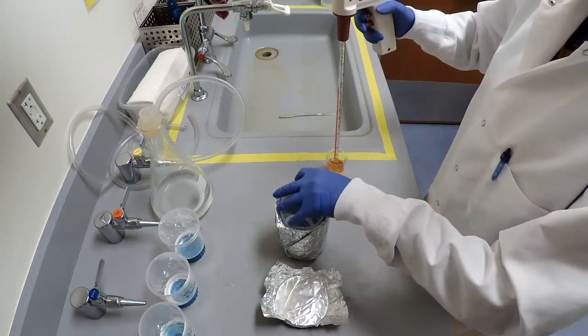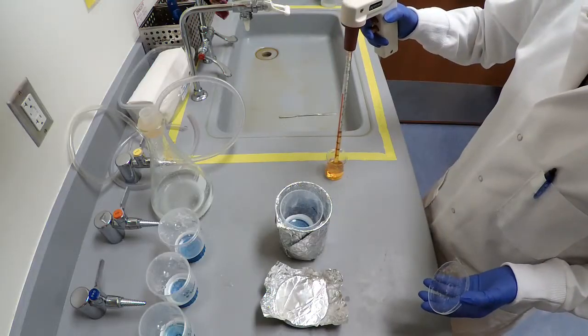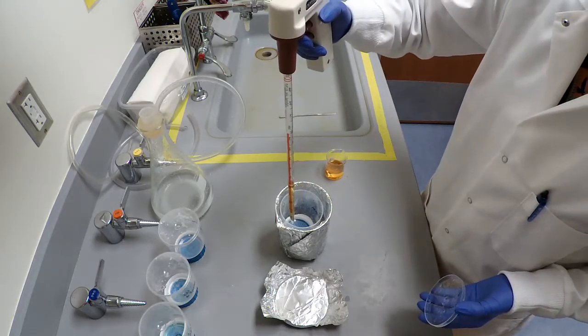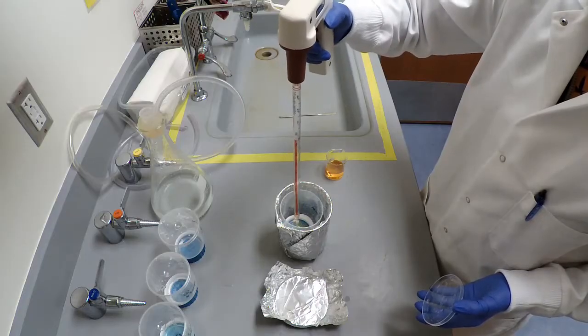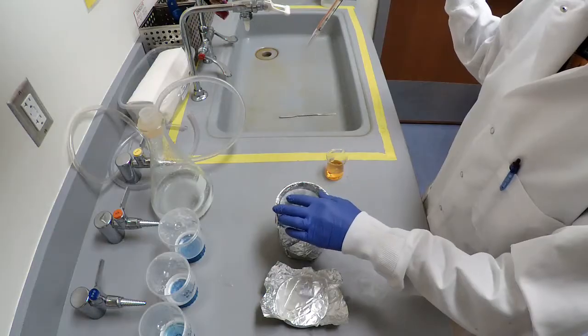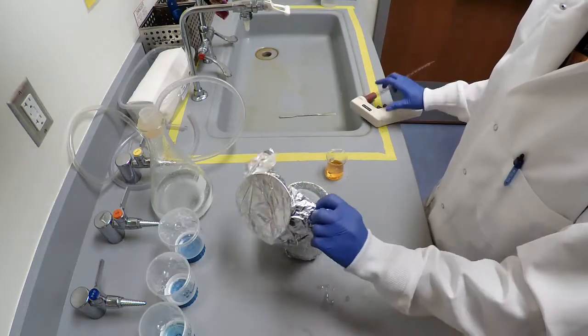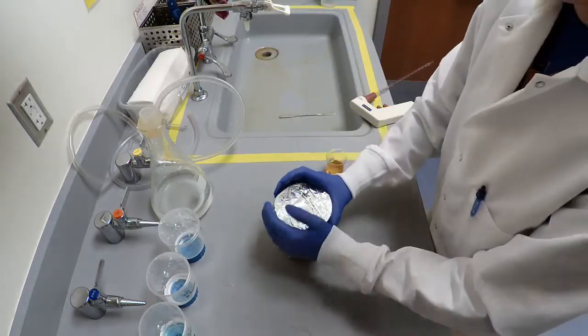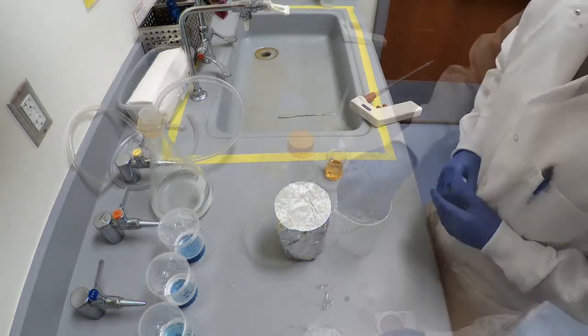Add 5 ml of Nile red at a concentration of 10 micrograms per ml. Cover with a foil lid and incubate at room temperature for 30 minutes.